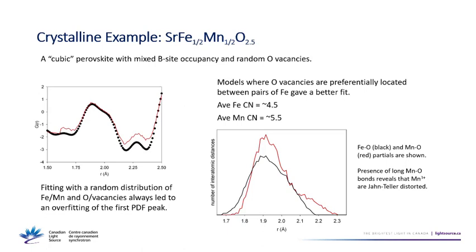And so once I was getting the proper total intensity, then RMC can actually fit it, right? Because if the total intensity is too much, it's always going to have a problem. And then once it was able to fit it, it came up with these here. And you can actually show too that if you put the baseline here, it goes something like this, and this peak actually drops below that 4 pi rho 0 baseline. So it actually is a little bit of a negative peak here, which is from this.